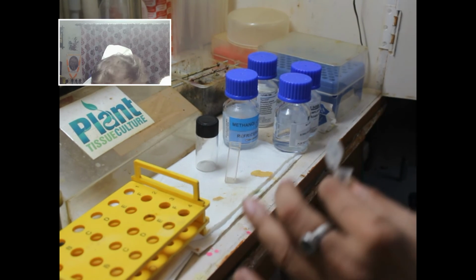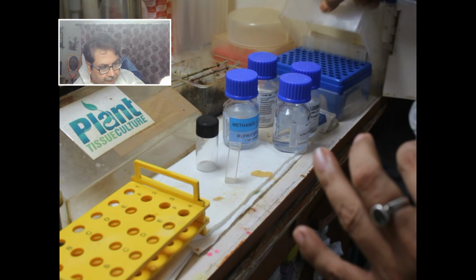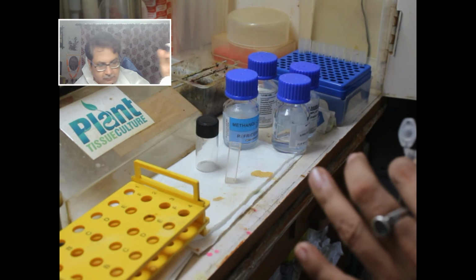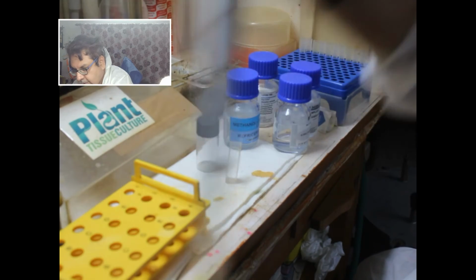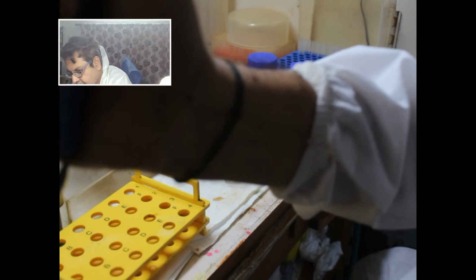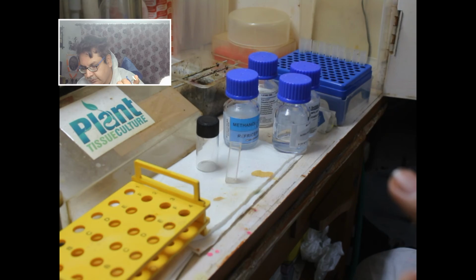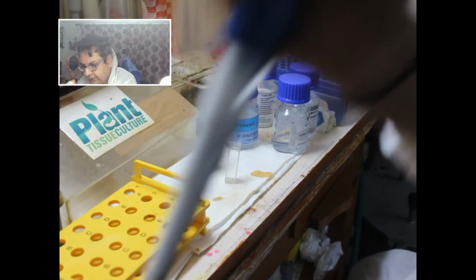The pipette tip is not working. We have to take another one. So we are just going to remove this culture media. You have to remove this culture media as far as possible, and be careful that no fungal part is touched. Only the culture media should be removed, and it is done.